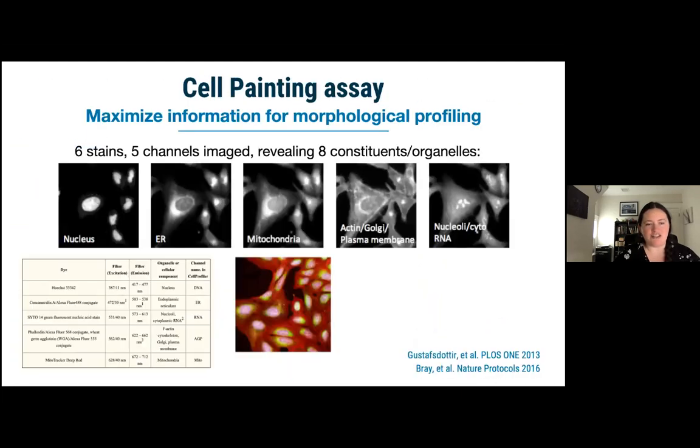We have both an ER stain and a Golgi stain in our Cell Painting panel. We use texture measurements, intensity distribution measurements, and also some others I didn't talk about, like granularity, to look at those in particular. It's an open question whether, if we identified them as objects, we'd learn even more, but it's just not a question we've had time to dig into yet.